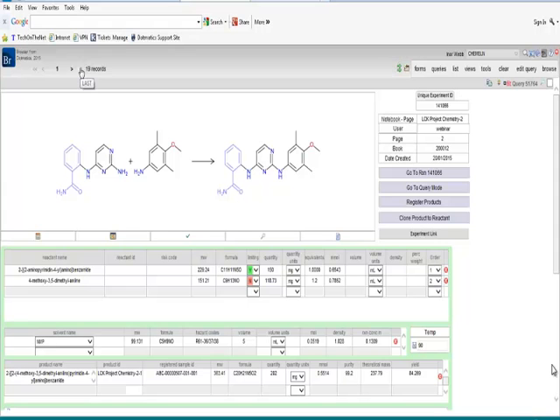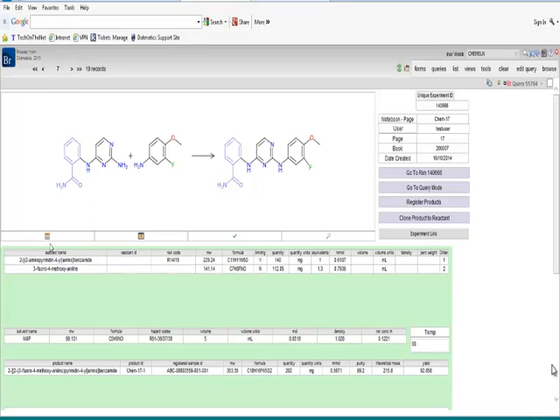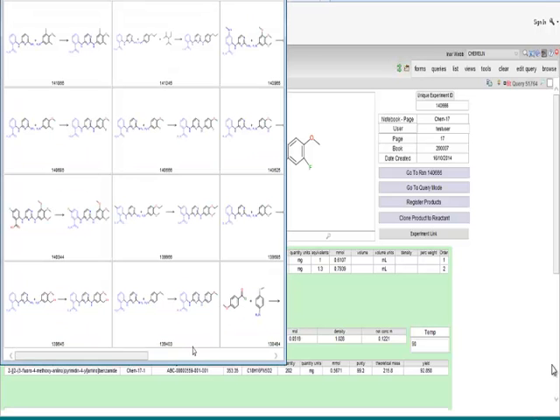So in this case, each record is an experiment in my lab notebook. And you can see the same interface is now used to display the data. And we've got information about the reagents and the products and the write-up, the conditions and everything here. And you can see the substructure that I drew has been highlighted here. I can scroll through these records, or I can scan through them in a grid, for example. And maybe I'm going to select one of these.